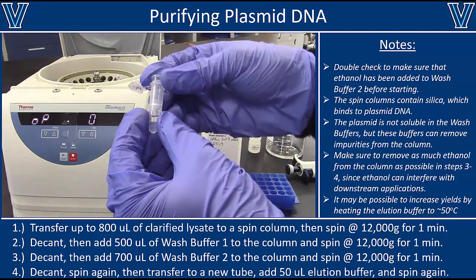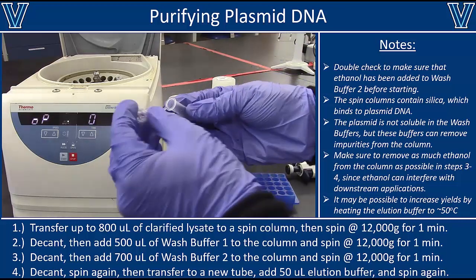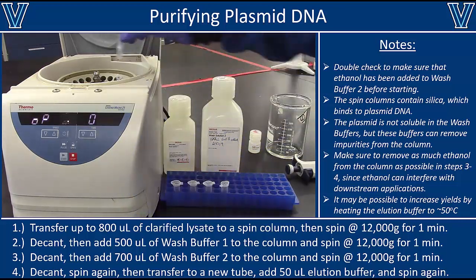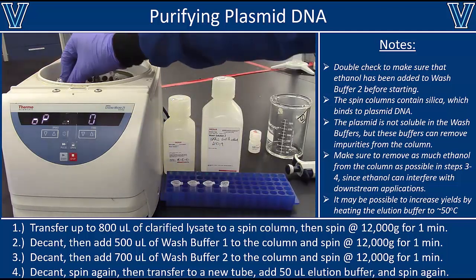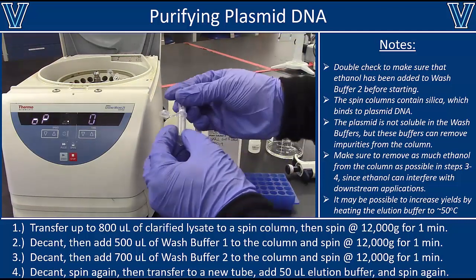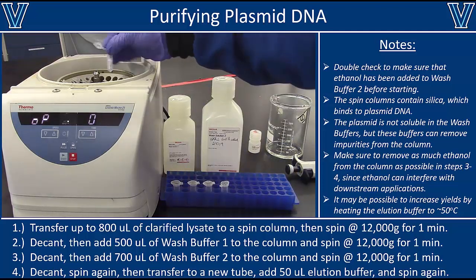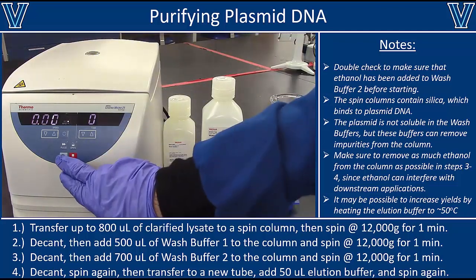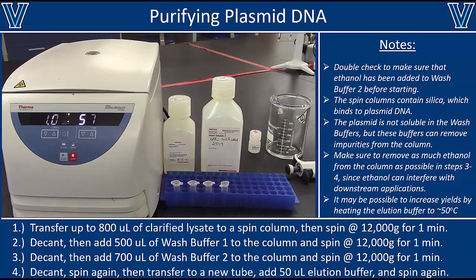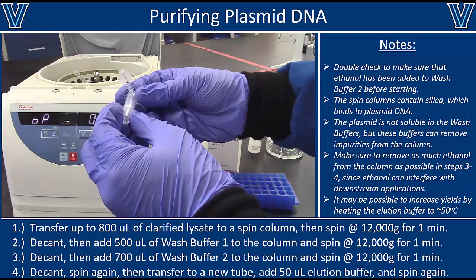But we're actually not done yet. What we're going to do next is take that collection tube and decant as much of the ethanol as possible. Then we're going to put that tube right back into the centrifuge and spin again at 12,000 G for 1 minute. The idea here is that there might still be some residual ethanol on the column, so we're going to spin again to make sure we get as much of the ethanol off of that column as possible before we elute the DNA. That's because trace amounts of ethanol can inhibit downstream applications that you might have in mind for these plasmid DNA samples. So here we go, now we've spun the column again.